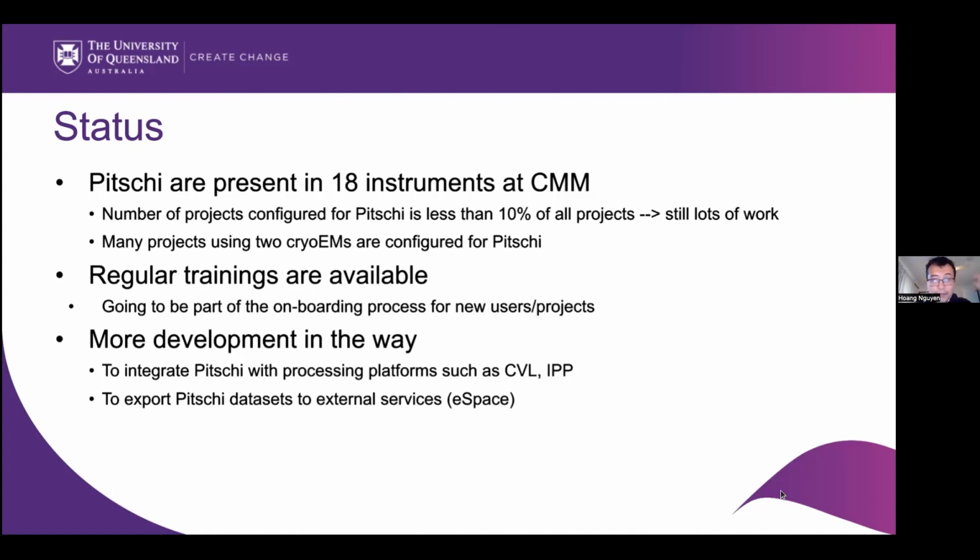But the good thing is that many projects using the two cryo-EMs are already configured and using Pitschi. So a lot of data coming lately is actually from the two cryo-EMs. And we do provide regular trainings, and that will be part of the onboarding process for new users and projects.